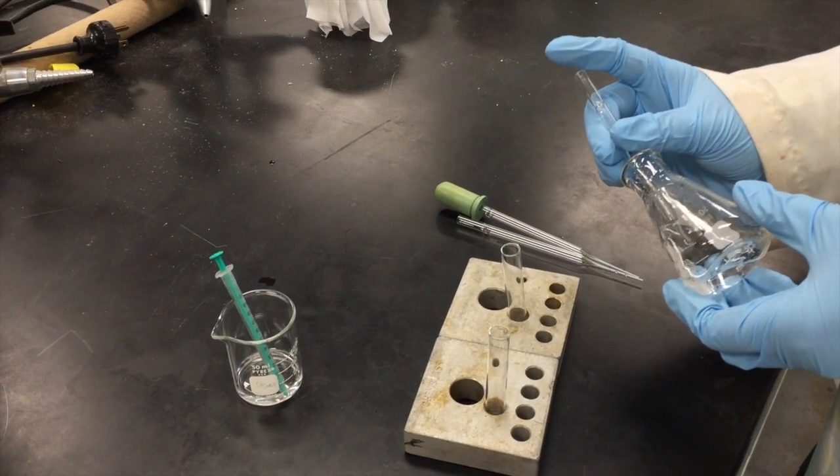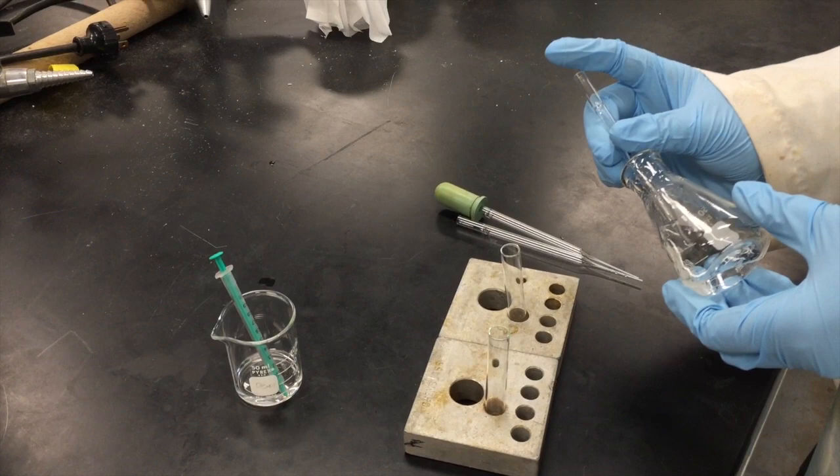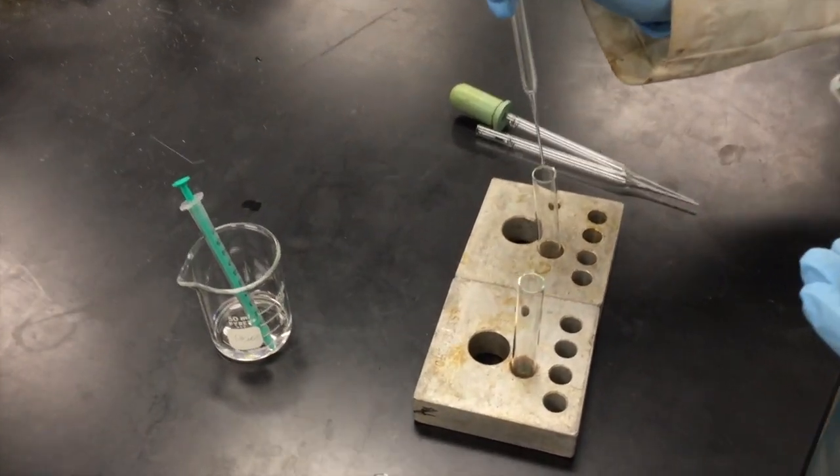Using the tilt pipette capillary action method, add two drops of your sample to the first test tube.